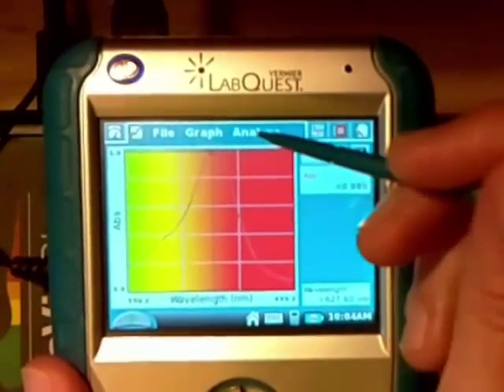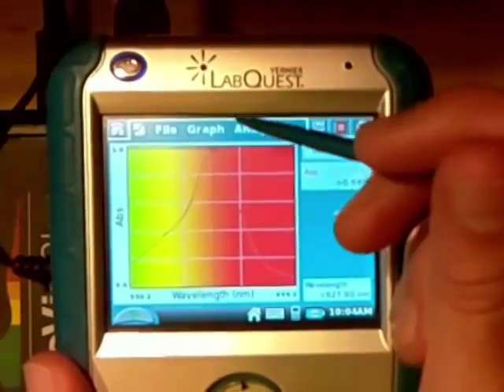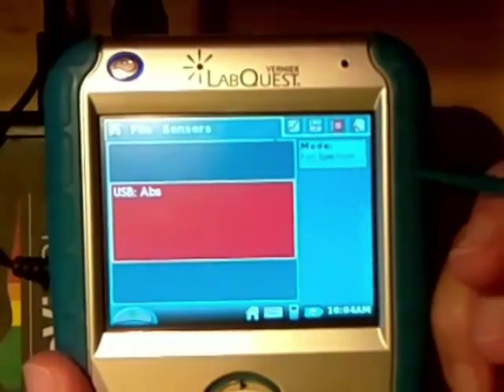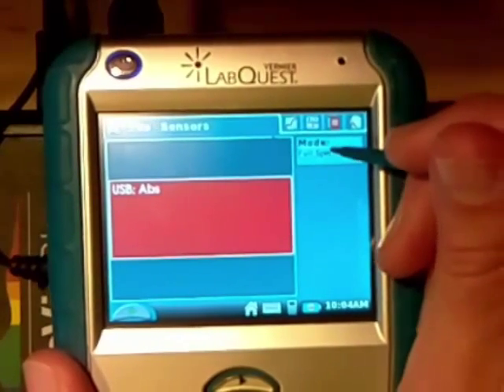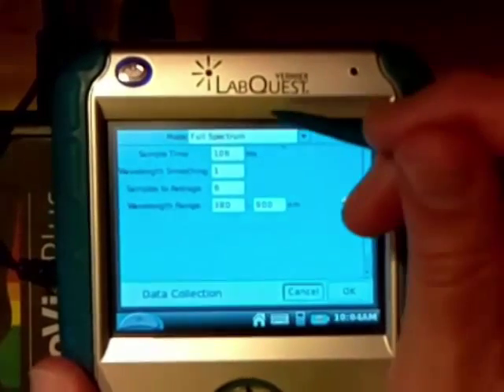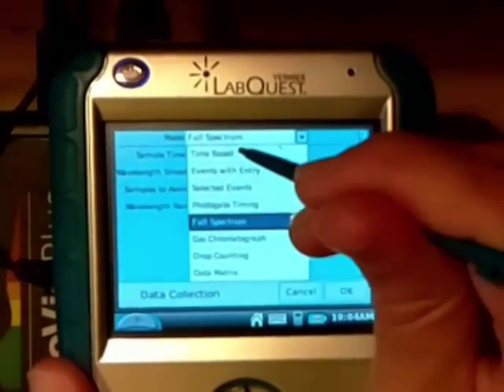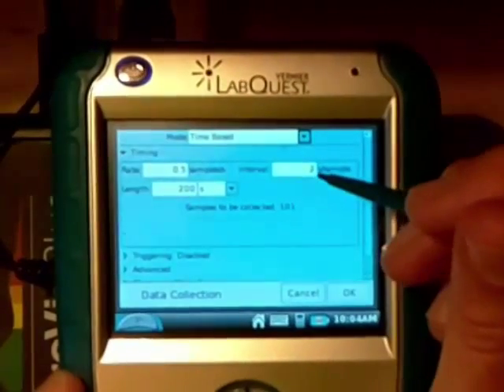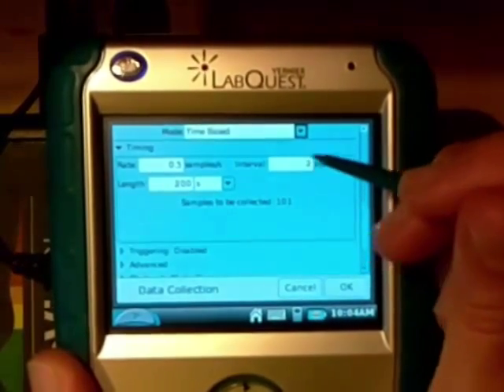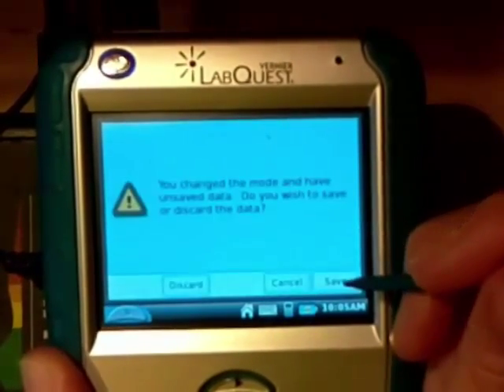So if I now want to collect the absorbance at that point — at 627.9 nm — the way I would do that is to go back to the original and click full spectrum. Here we have a variety of options: if we click down we can do time-based, events with entry, and so forth. I'm going to choose time-based. Right now the default is set up to collect a sample every two seconds, which should be sufficient — we're not actually collecting a time series, just taking advantage of one of the options.